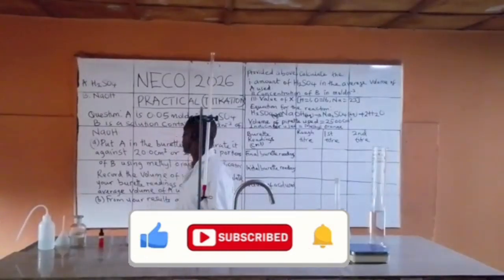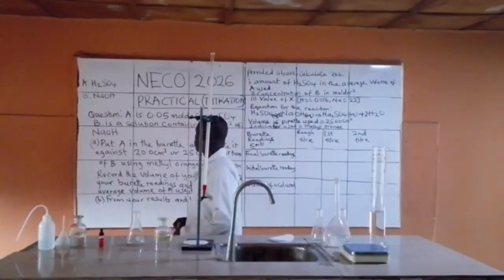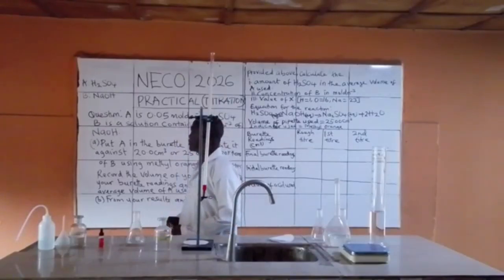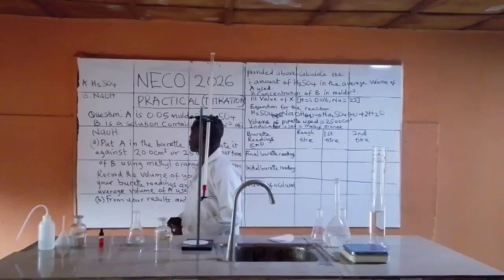Today, we'll be focusing on the NECO 2026 practical, which is on titration. It is an acid-base titration. The acid is tetraoxosulphate(VI) acid, H2SO4, which serves as A. The base is sodium hydroxide, NaOH, which serves as B.